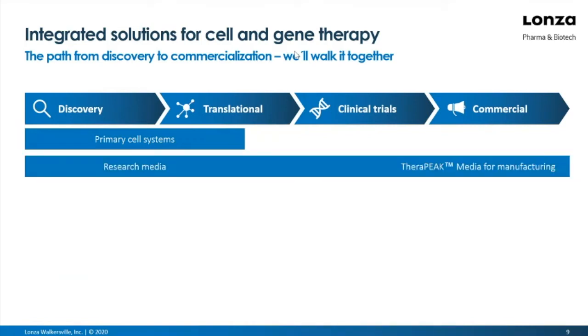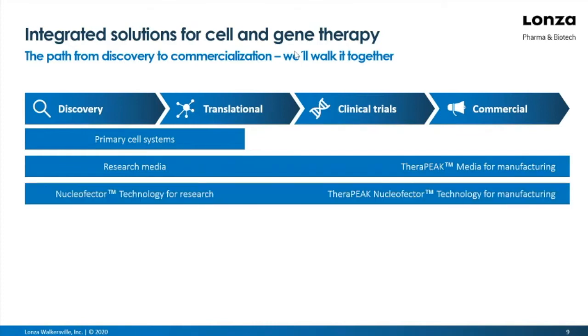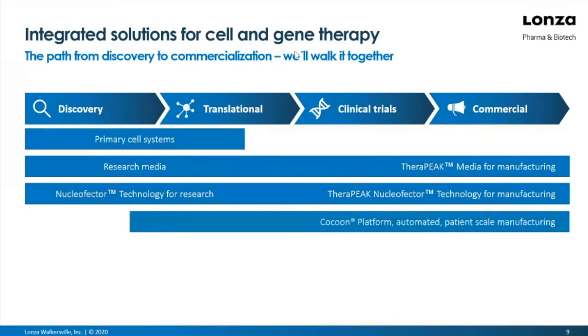Research media, or GMP or therapeutic media, is very important, because to culture the cells you have to give them a lot of nutrients for them to grow and expand enough for treatment per se. For transfection, or you can use virus, it is something to genetically modify the cells. It could be T cells, it could be NK cells, and so on. So this is for genetically modifying the cells.